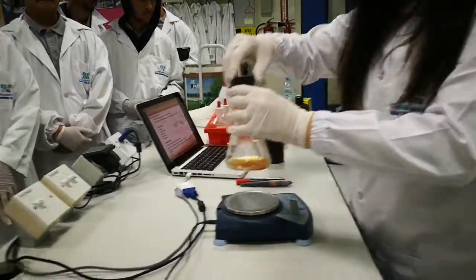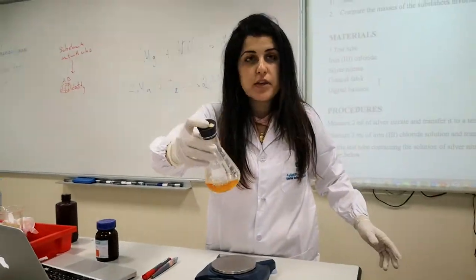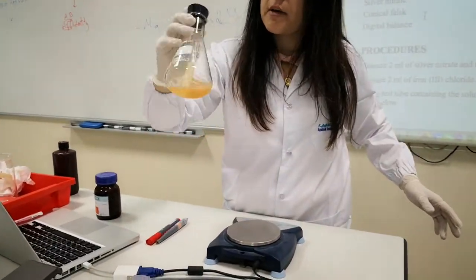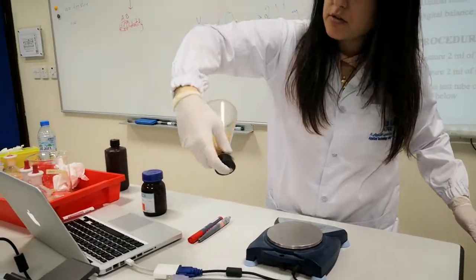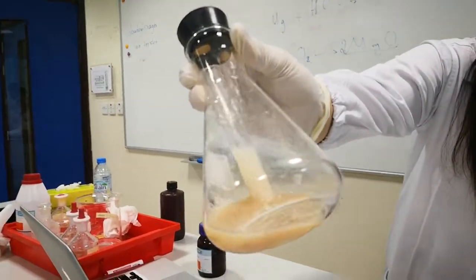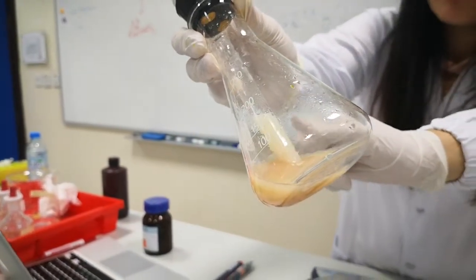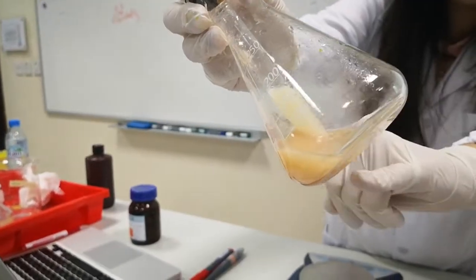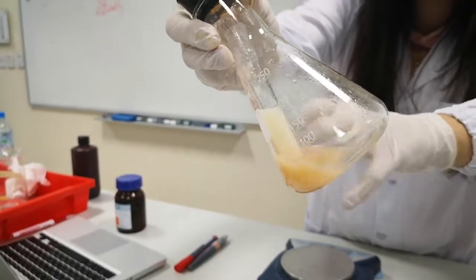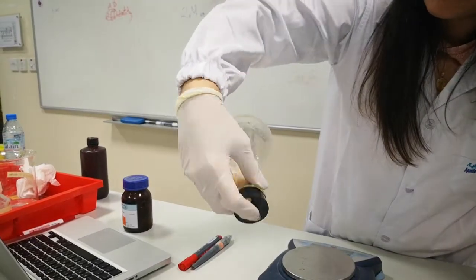Now I am going to let the two reactants mix together in order for a chemical reaction to occur. As you can see, a solid white powder is forming in the test tube, and a cloudy solution is also remaining in the flask.